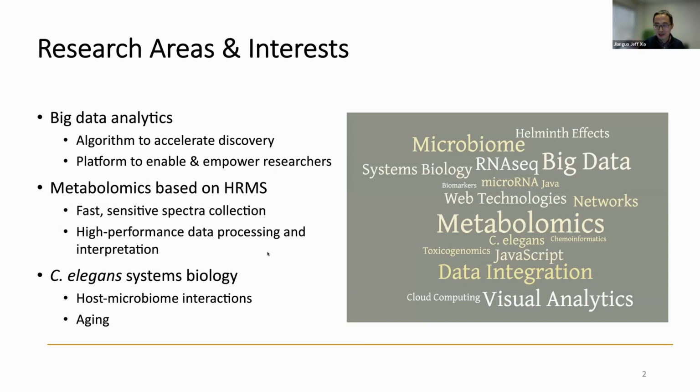So today's topic is mainly focused on MetaboAnalyst 5.0, because people are interested, but I will briefly touch on other research areas because it all seems big-picture related.